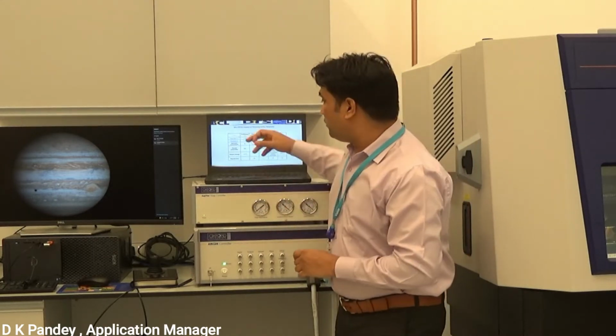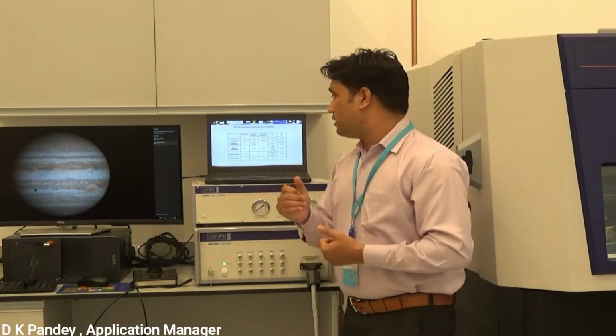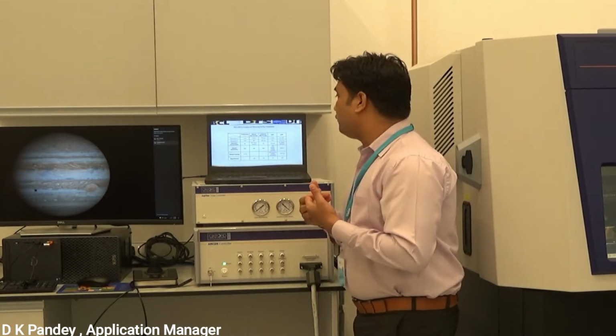Here, one very interesting question most people have is: why should I use the AFM? Why can I not do the SEM? Why can I not do the TEM? So I made a comparison sheet, so you may have a clear idea of what AFM can do and what the others cannot do. For example, you can discuss the profilometer, optical microscopy, confocal microscopy, and scanning electron microscopy.